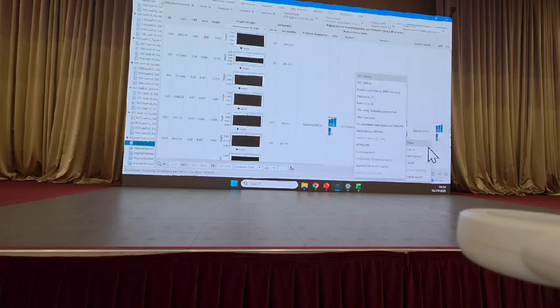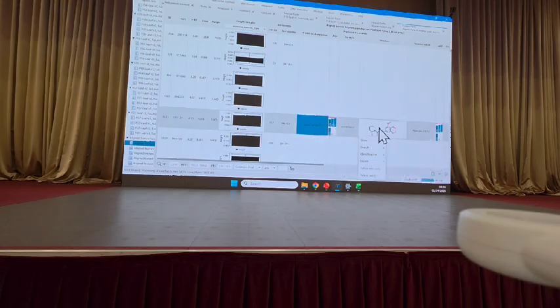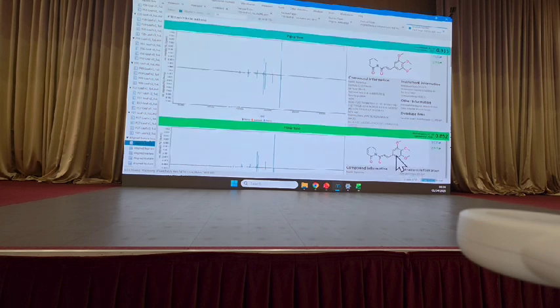And just so you can see what that looks like, you can right-click anything that has an annotation. You can go to Show, and you can select Spectral Database Search Results. So just so you can actually see what is going on, I can't see from this angle. Okay.